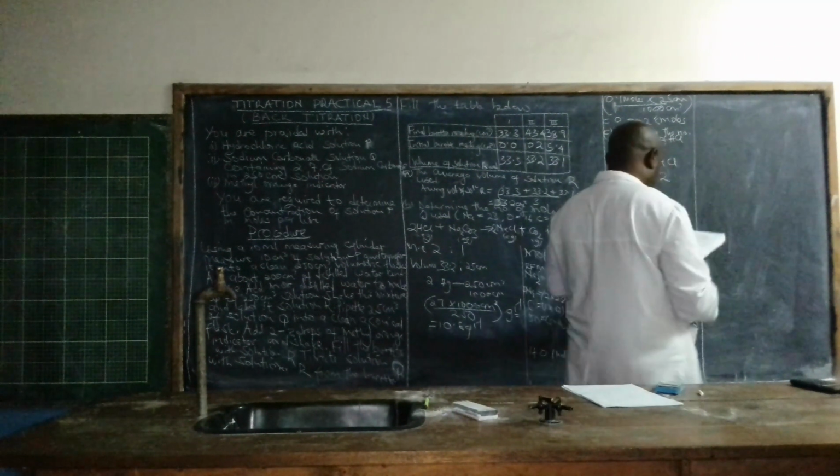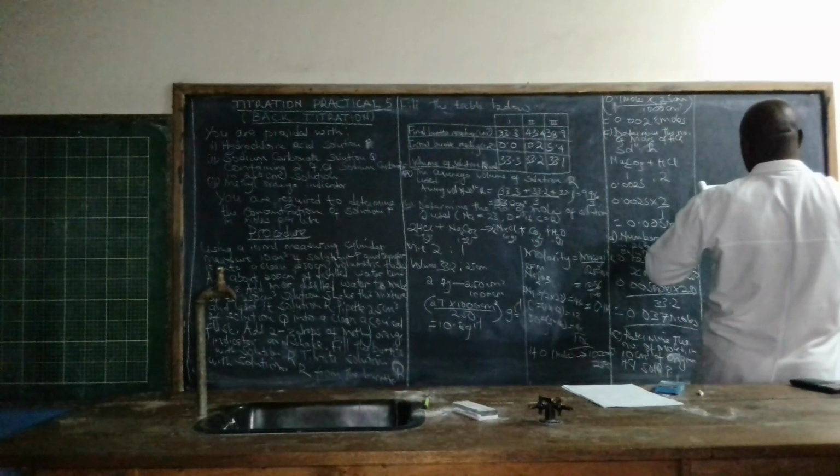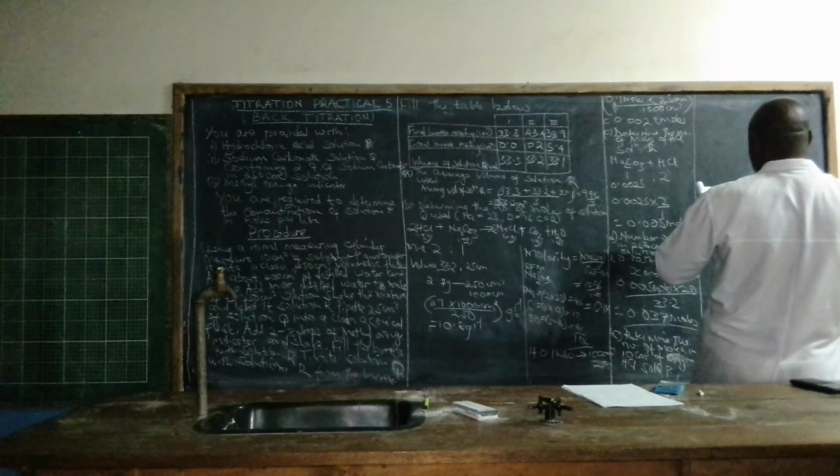Solution P. So in this one we are going to approach it this way.